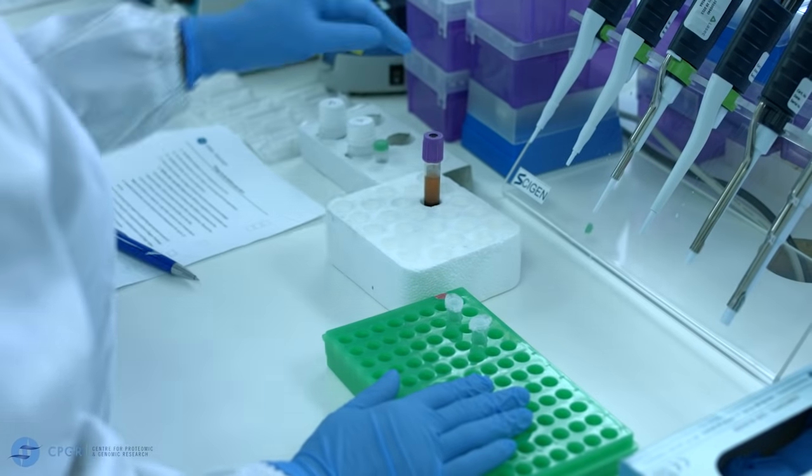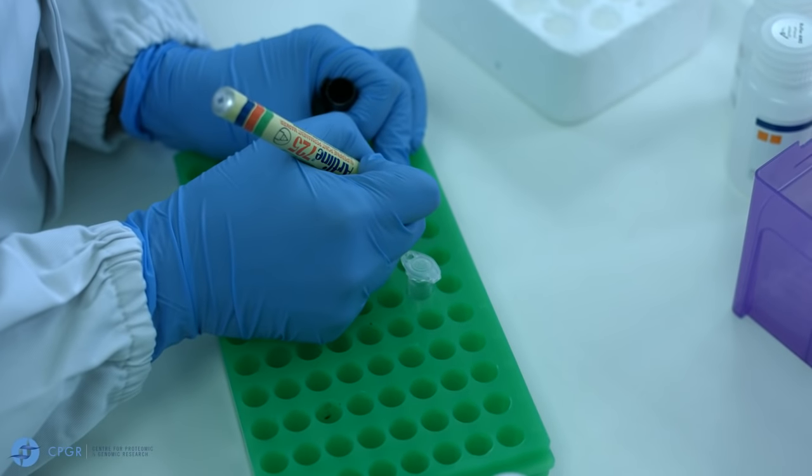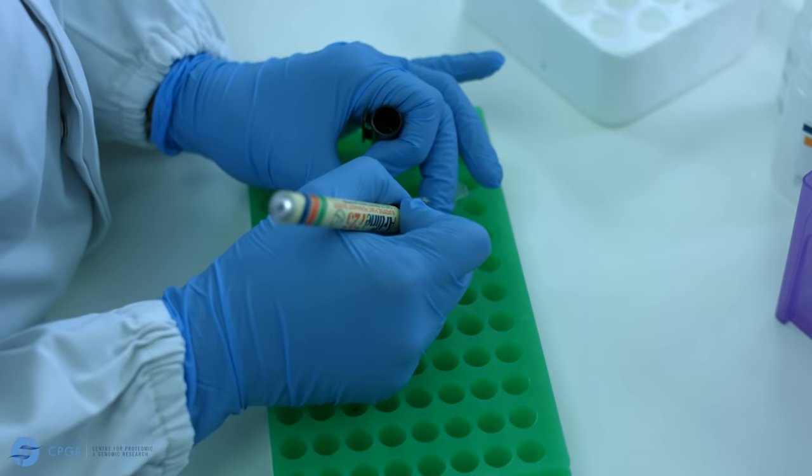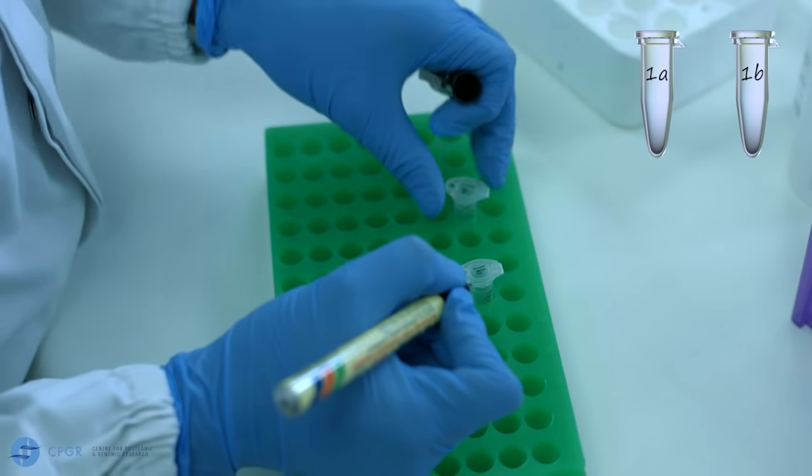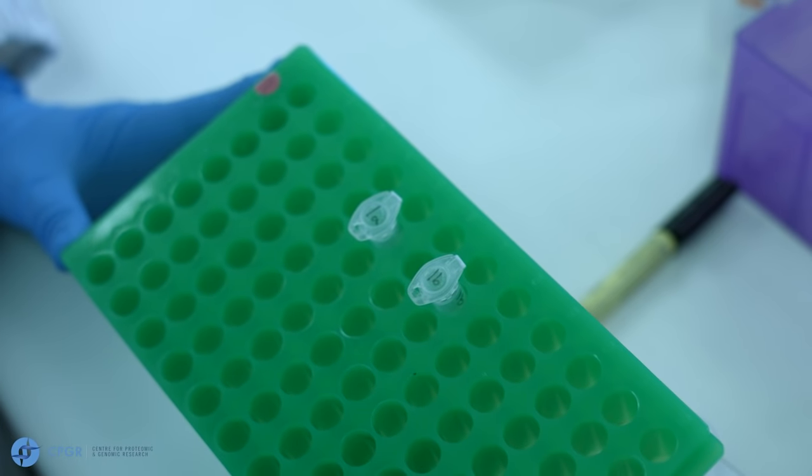So you have prepared the area where you will be carrying out your extractions and you will begin by labeling the microtubes with sample IDs using a permanent marker. We label the sides of our tubes as well in case ethanol comes into contact with the microtube lids.